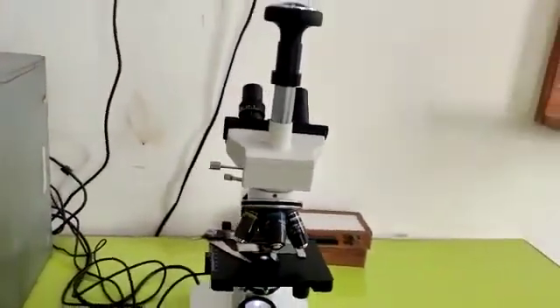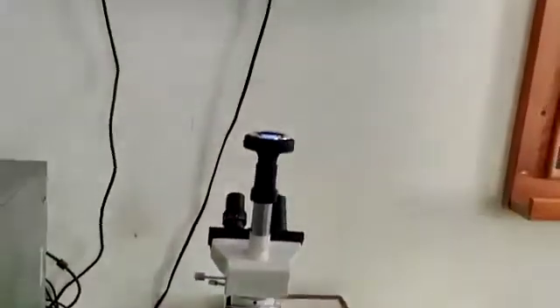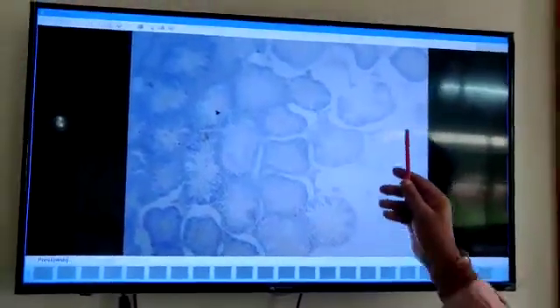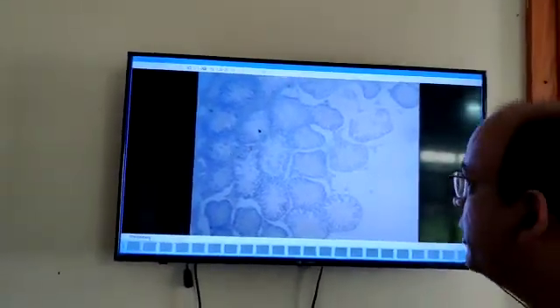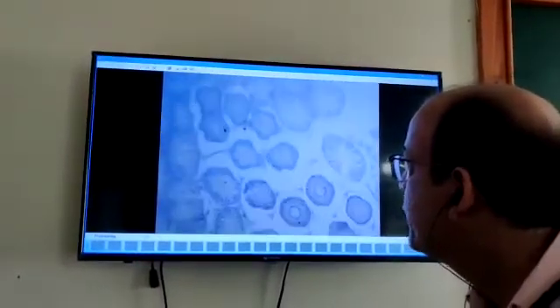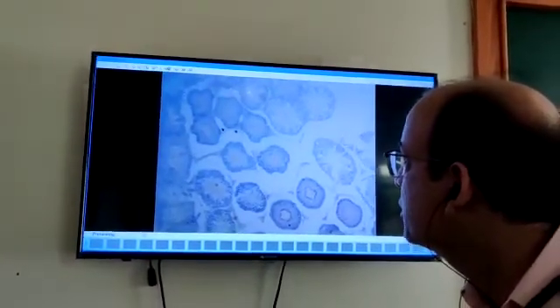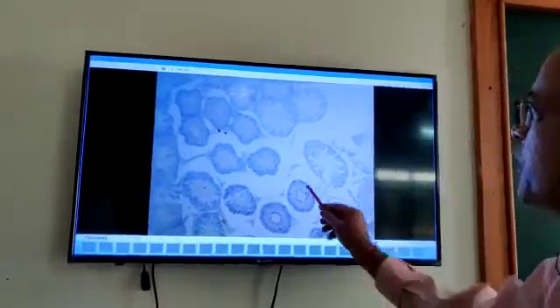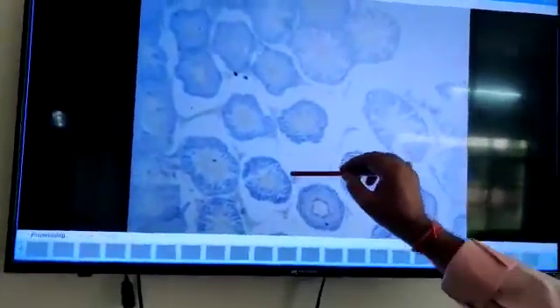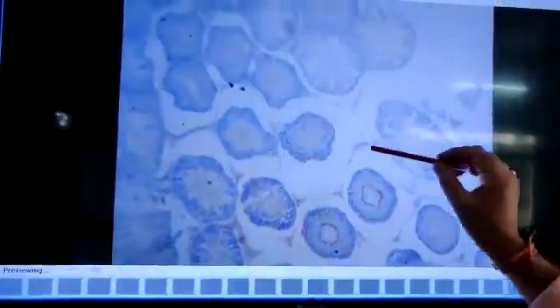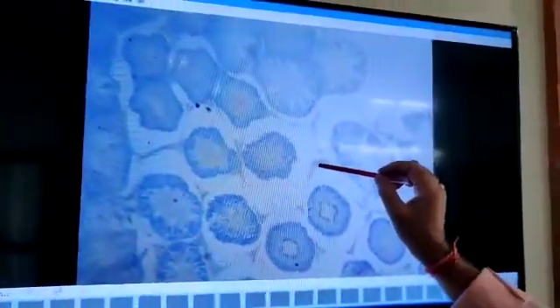With this microscope I will show you the transverse section of testis. In this slide you can see these round structures — all these round structures are seminiferous tubules. In between the seminiferous tubules, all this is connective tissue, and this connective tissue has Leydig cells which secrete testosterone.